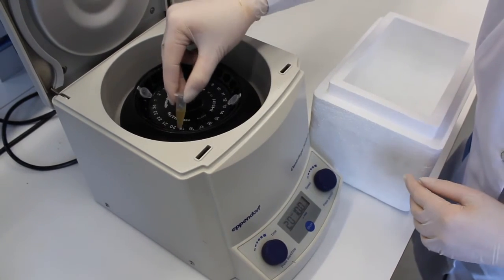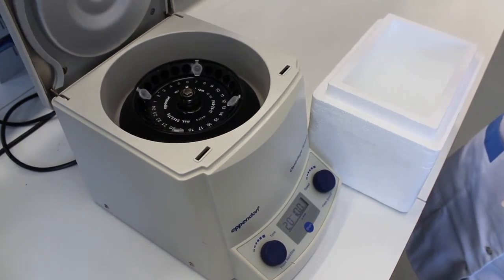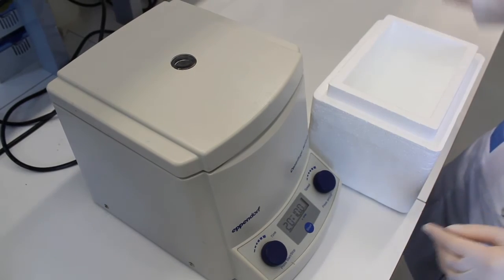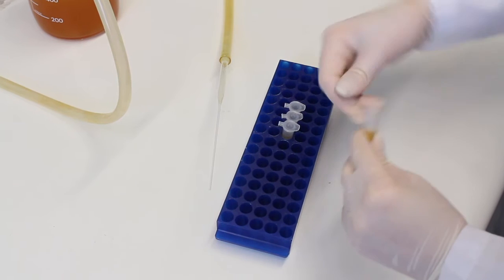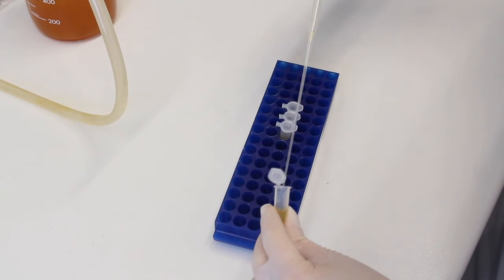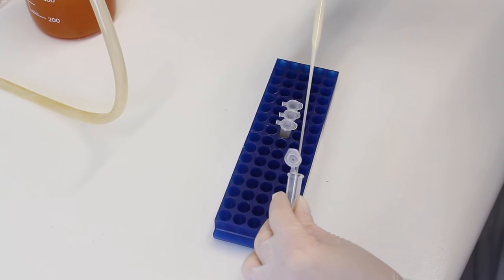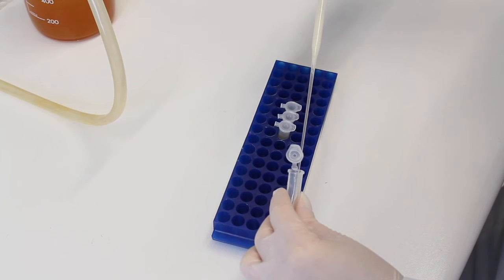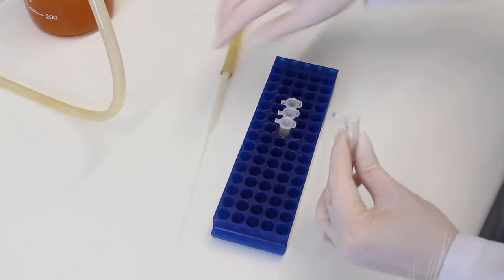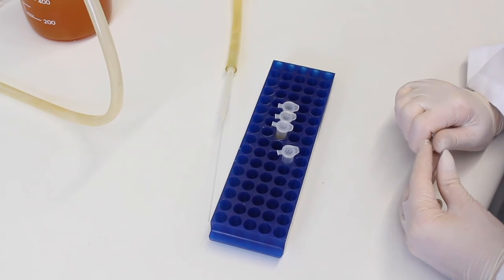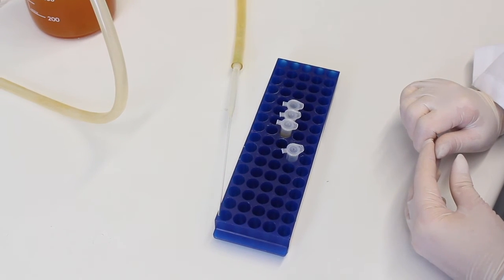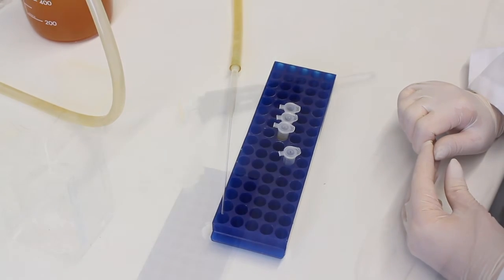The centrifugation can be performed at 4 degrees or at room temperature. Discard the supernatant. After that centrifuge for two additional minutes at 1500G to eliminate entirely the supernatant.